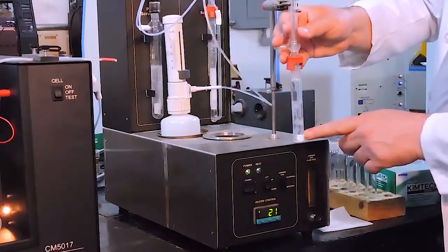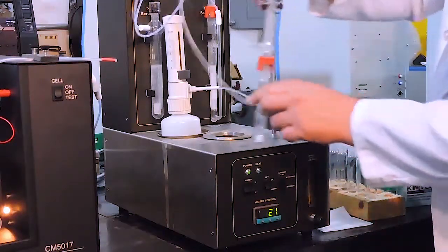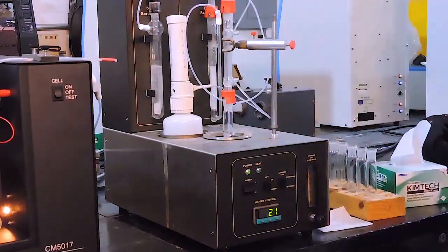If you notice that there's a bubble in the Teflon cup, tap the flask gently before placing it in the heating block. The system will measure until it reaches % difference criteria, and then it will stop. At that point you can press Lift, then change the sample flasks and put another sample in.